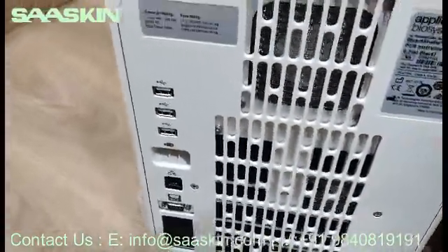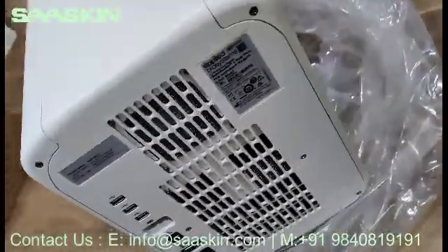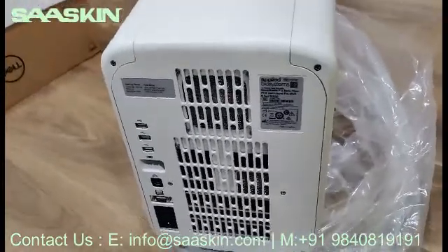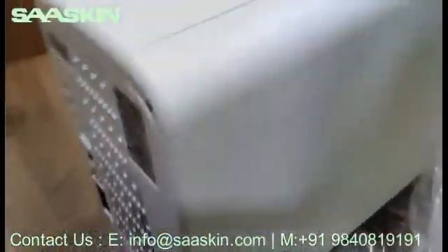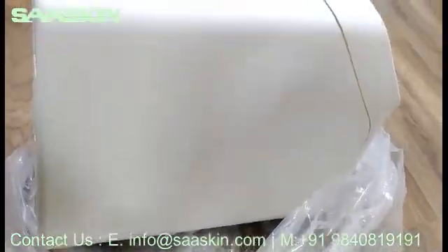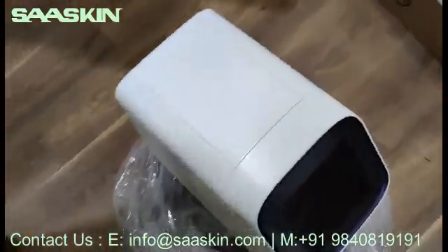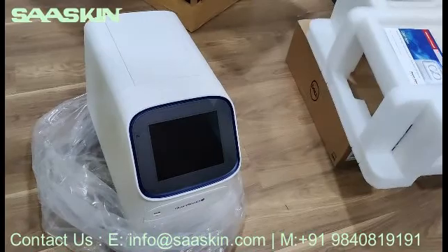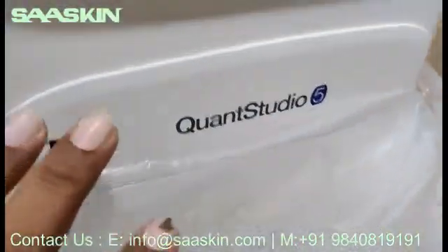This is the back side of the instrument. I can show you the other side as well. Let me come to the front — this is how the instrument looks like. Let me open the accessory box. You can see this is the QuantStudio 5.